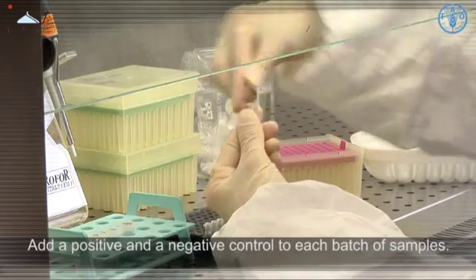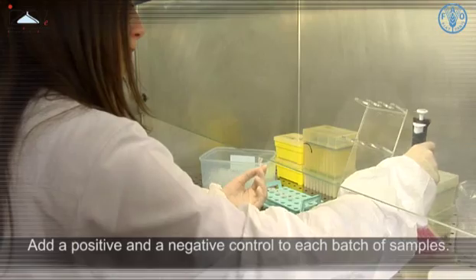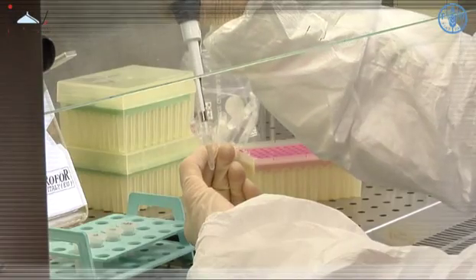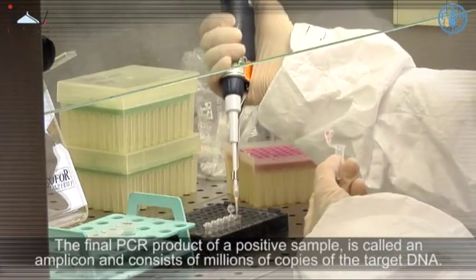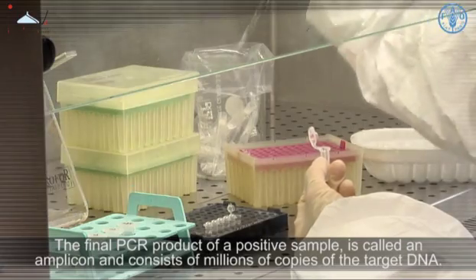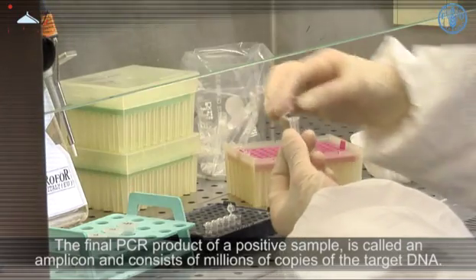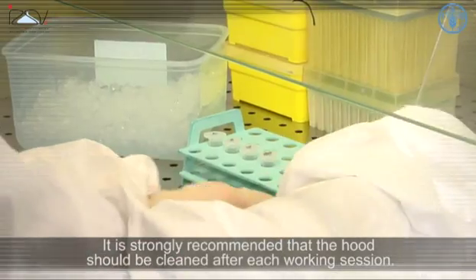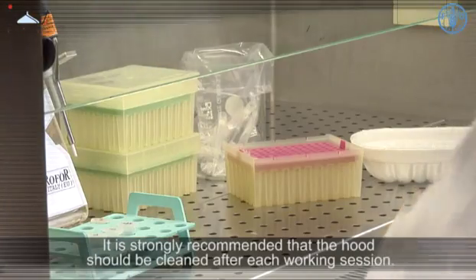Add a positive and a negative control to each batch of samples. The final PCR product of a positive sample is called an amplicon and consists of millions of copies of the target DNA. It is strongly recommended that the hood should be cleaned after each working session.